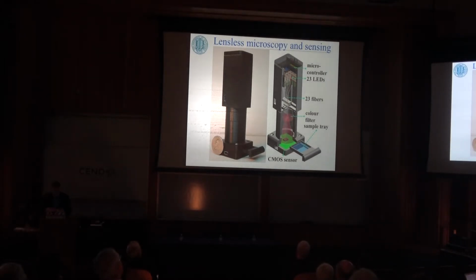So these are giving you some examples of how this computational platform with essentially a CMOS imager, literally that's being used in our smartphones, can perform advanced microscopic imaging over a large sample area, and at the same time use it for sensing purposes. So it's a nice platform that I think can be used for various different diagnostic purposes. In my last part of the talk, I'd like to tell you how we've actually taken the same framework and used it as a sensor for motility.